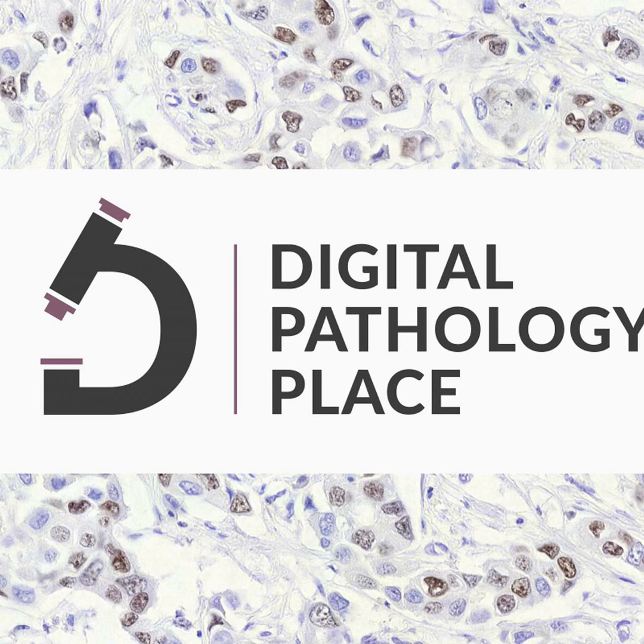Cells in tissue are interacting as we would expect. They can be of all different shapes and sizes. And it also depends on the plane of sectioning of where cells are going to be captured. And so it can be a challenge to elucidate those edges of cells that are interacting in complex tissues with a lot of heterogeneity, and also gets worse as disease states get worse.